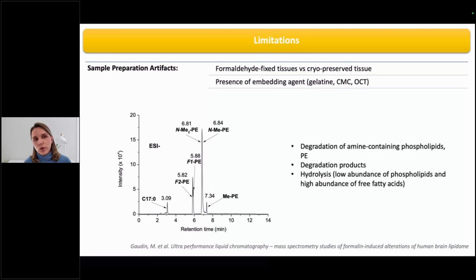Sometimes you don't have the choice. You really have to fix your tissue because you are doing your analysis days or months after, and you are risking degrading your tissue. Sometimes you don't. But it's important to take into account that several lipids could be degraded due to this approach. And with that, with the limitations, I conclude my presentation.